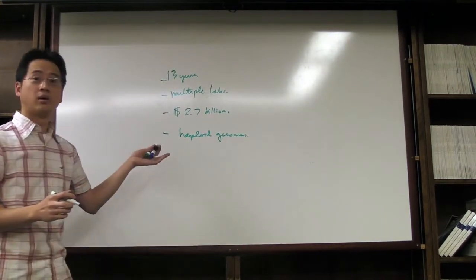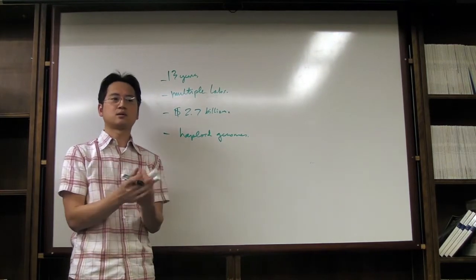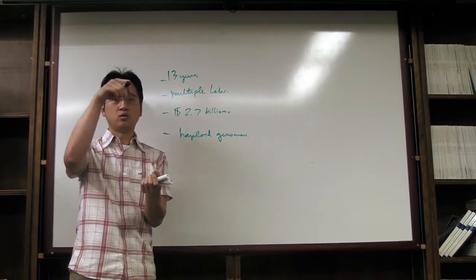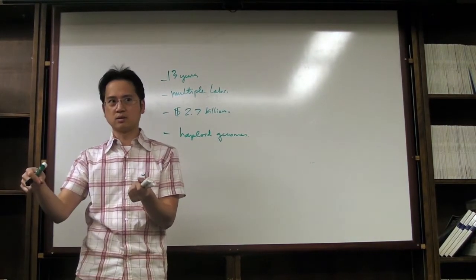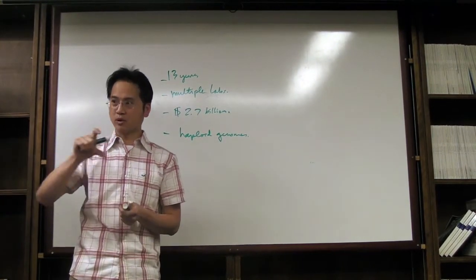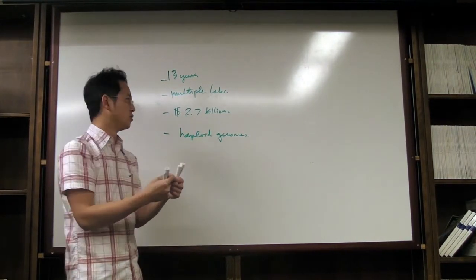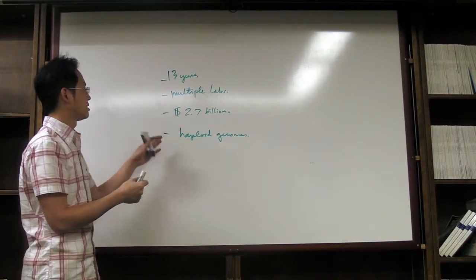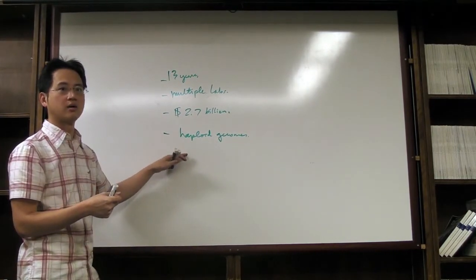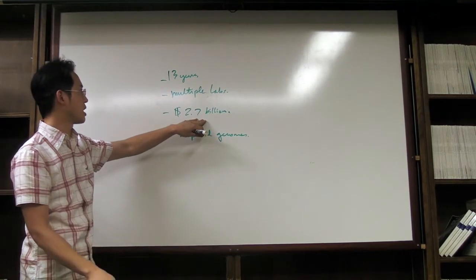And you can see why it took so long, right? It's not a parallelized process. You pick one colony, you do one mini prep, you do one Sanger sequencing, or two, forward and reverse, you put it through one capillary run in one well of a 96-well plate. So it's not a surprise that it took such a long time and a lot of money, because of all the effort that's needed to go into each reaction.